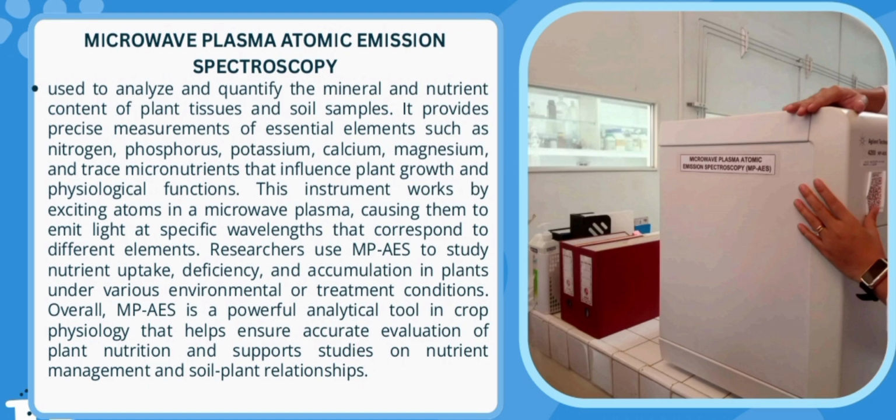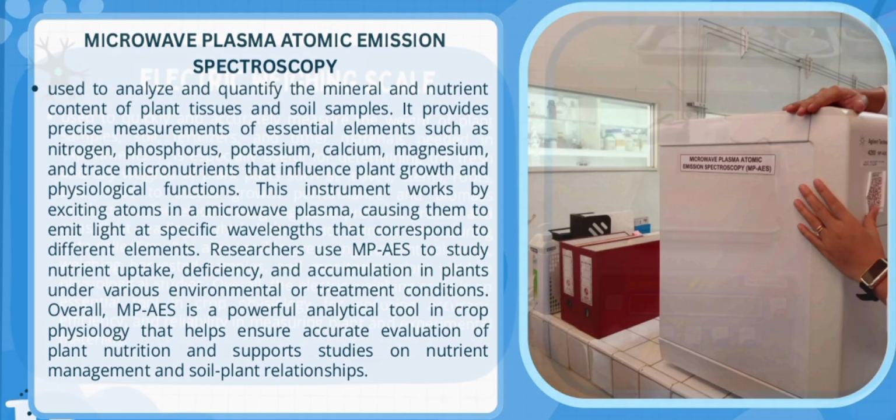Researchers use MP-AES to study nutrient uptake, deficiency, and accumulation in plants under various environmental or treatment conditions. Overall, MP-AES is a powerful analytical tool in crop physiology that helps ensure accurate evaluation of plant nutrition and support studies on nutrient management and soil-plant relationships.